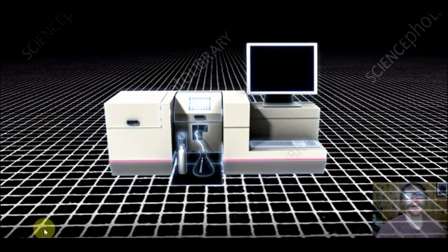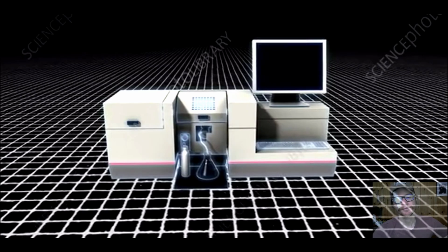Okay, I want to show you a quick animation. This is actually pretty nice walkthrough just of how an atomic absorption spectrometer works. So we have one that looks just like this at CC. So I'm going to play this video.